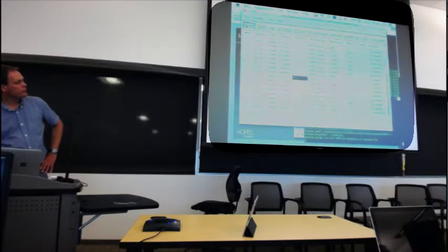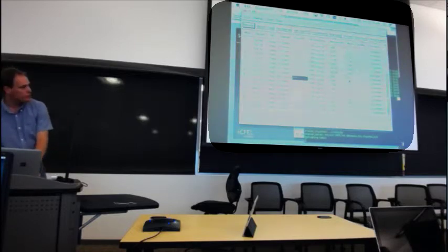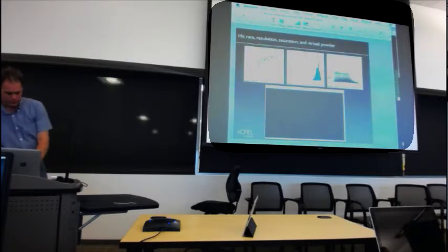Okay, and you can click refresh. Once it gets to its first checkpoint at 1,000 files, it says, okay, I've started, I've not finished, but I haven't found any hits yet. That doesn't surprise me, because if I go over to the experiment, this data set actually starts off with a very low hit rate, so you won't get instant gratification. But once it runs, you should be able to come out with that pretty quickly.